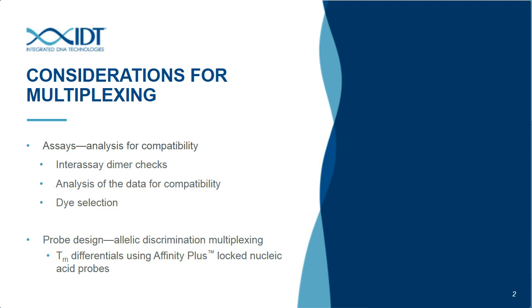As Sean mentioned, I'm a field application scientist at IDT, focusing on our qPCR and custom oligo products. A portion of my talk today will be looking at considerations for multiplexing, primarily looking at analysis for compatibility of different assays. The second part of my talk will be looking at some different probe designs for allelic discrimination multiplexing.